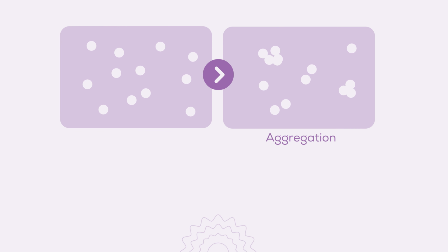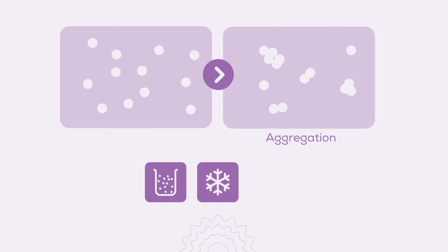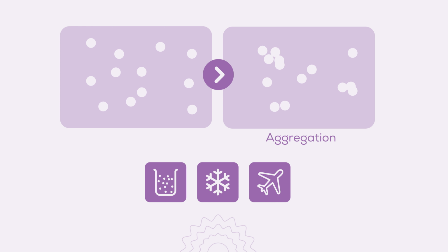Any detection of larger than expected particles could be indicative of particle aggregation, which is crucial to identify, as this can hint at particle instability. Identifying aggregates could suggest a need to refine processes in manufacturing, storage, or transportation. And it goes without saying that sample instability and aggregation can compromise product efficacy and safety.